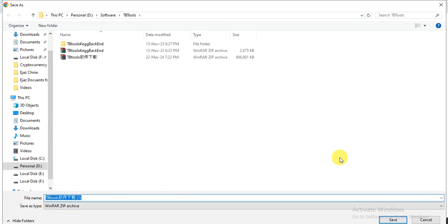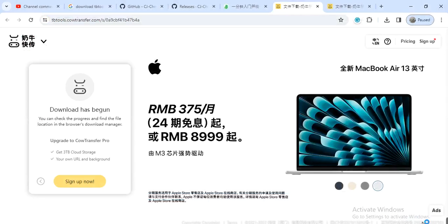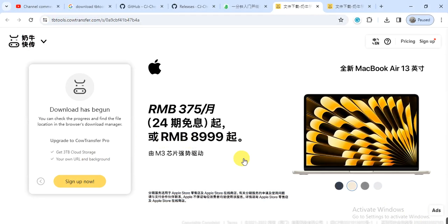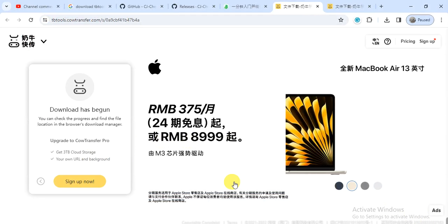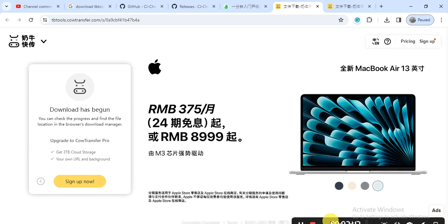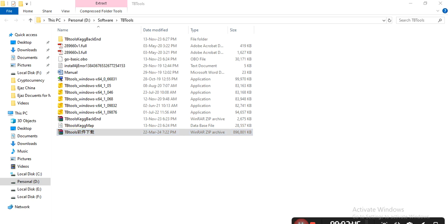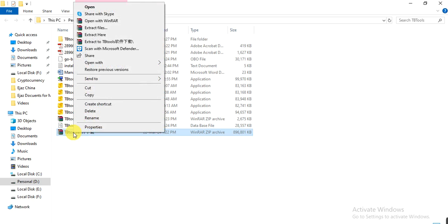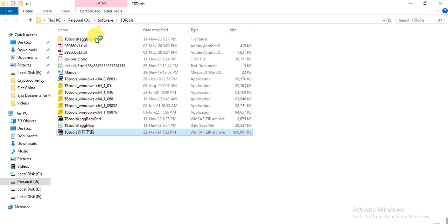After downloading, you will open that folder. Here is the folder that contains my downloaded TBtools. We will extract it - right-click and extract here.